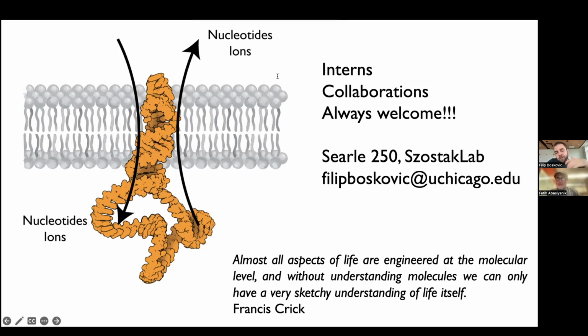But yes, don't expect that in 1 day you'll have 100 pores left. So usually we go from, let's say for RNA sequencing, at least from 1600 to like 900 after like 16 hours of measurement. So that's normal. But within 1 hour it should not be that bad.